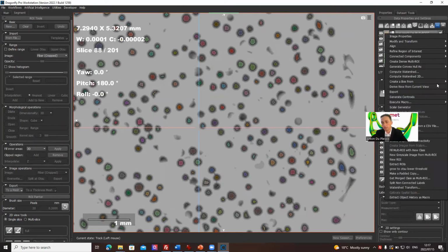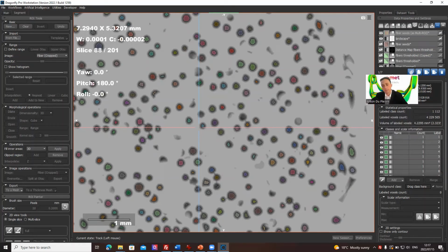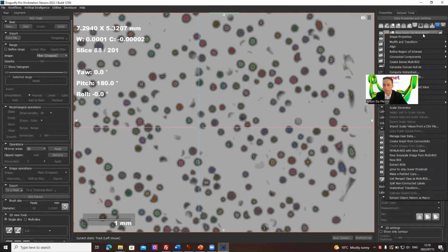And on the multi-ROI, by the way, I don't think I've explained very carefully. A multi-ROI is like a region of interest, except there are different classes set. Each item has a different class. So it's like multiple regions of interest. This is very useful for selecting certain areas or certain items within a region of interest. It's used for many functions and it's necessary for deep learning tools.